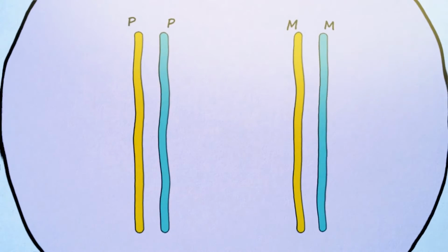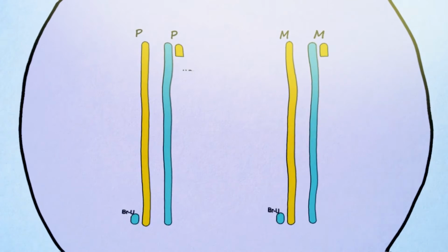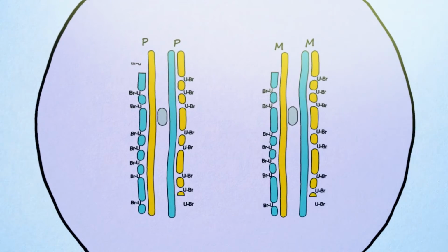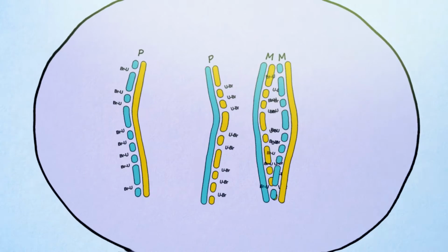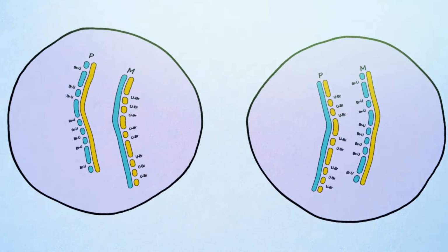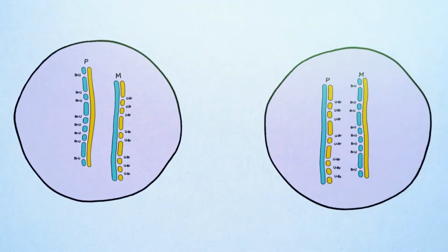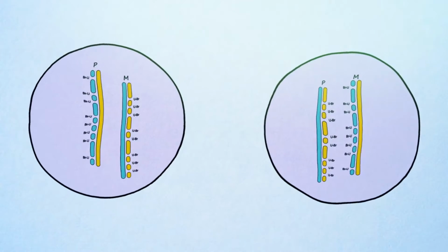However, if cells are pulsed with a dose of the thymidine analog BrdU for exactly one cell division, the BrdU becomes incorporated into the newly formed DNA strands, making it possible to distinguish the sister chromatids. Upon cell division, each daughter cell will inherit a template Watson strand which does not contain BrdU, and one nascent Crick strand with BrdU, while the other sister chromatid will be the exact mirror image.